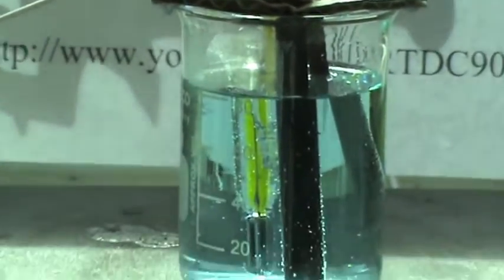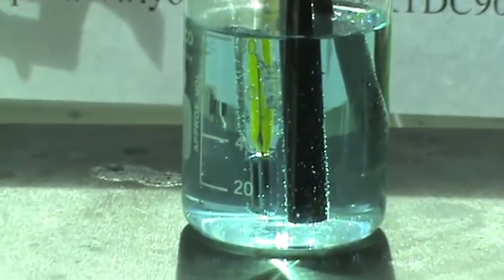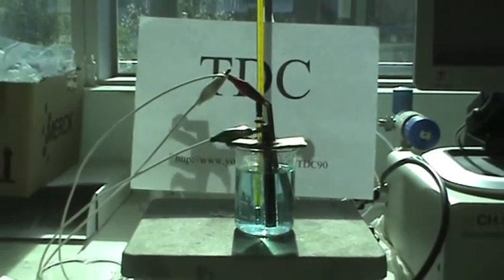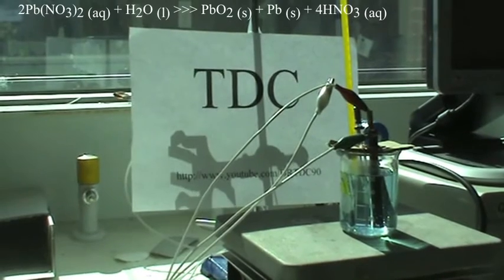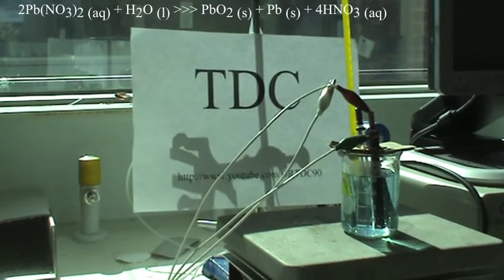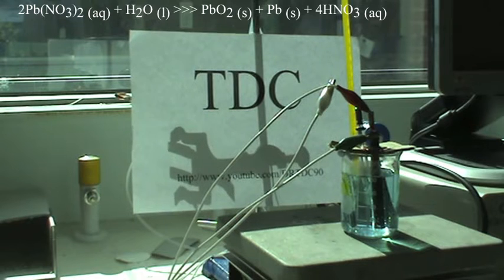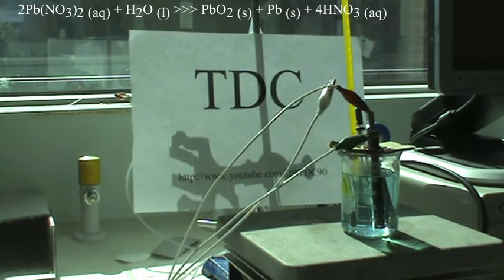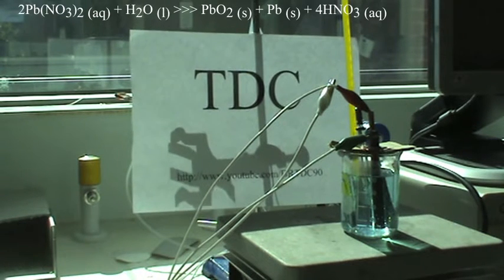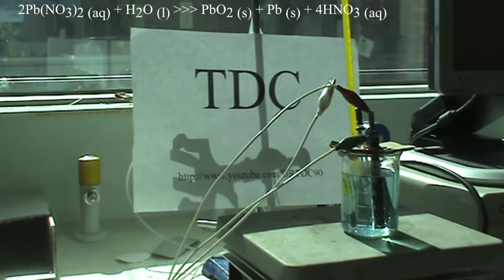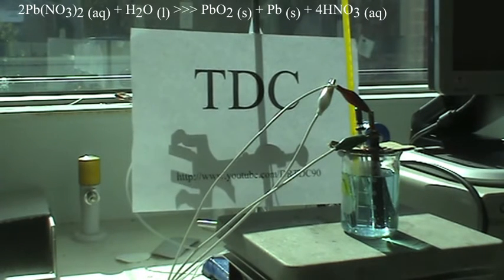While the experiment is running, let's have a look at the chemistry behind it. During electrolysis, the acidity of the electrolyte gradually increases, and the concentration of lead 2+ ions decreases according to the following reaction. As can be seen in the equation, lead metal is produced at the cathode, which is a problem.